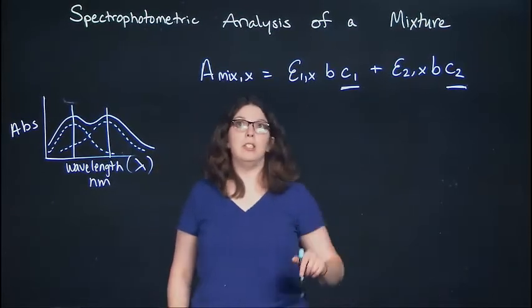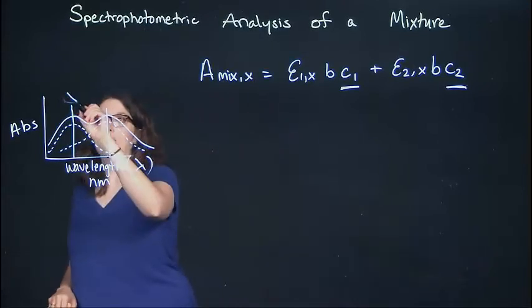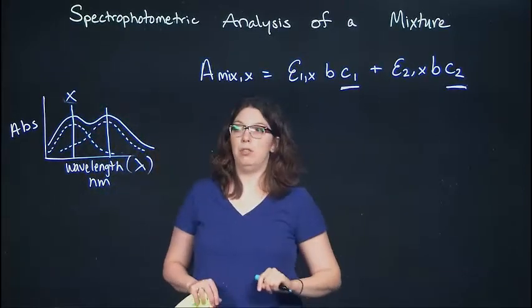What this equation is saying is that the absorbance at a particular wavelength x is equal to the sum of these two components.